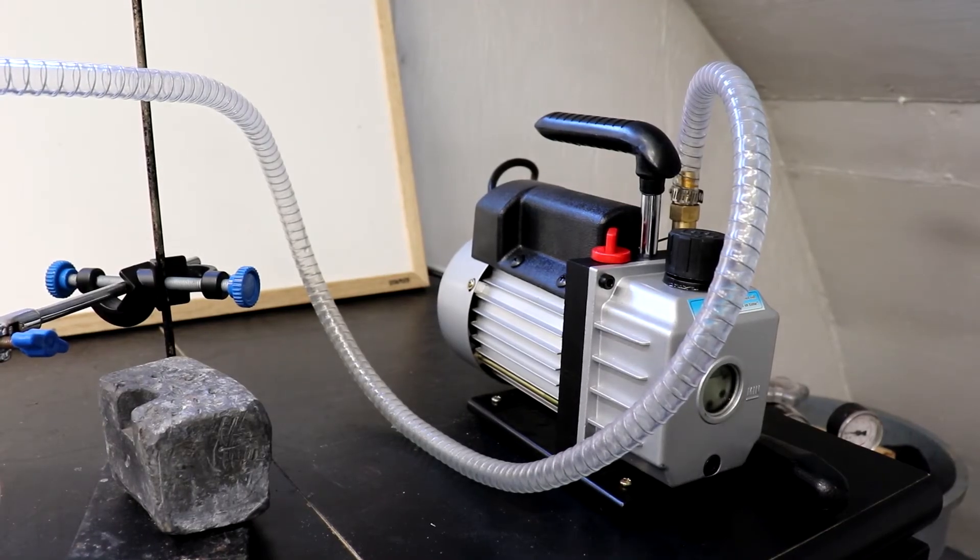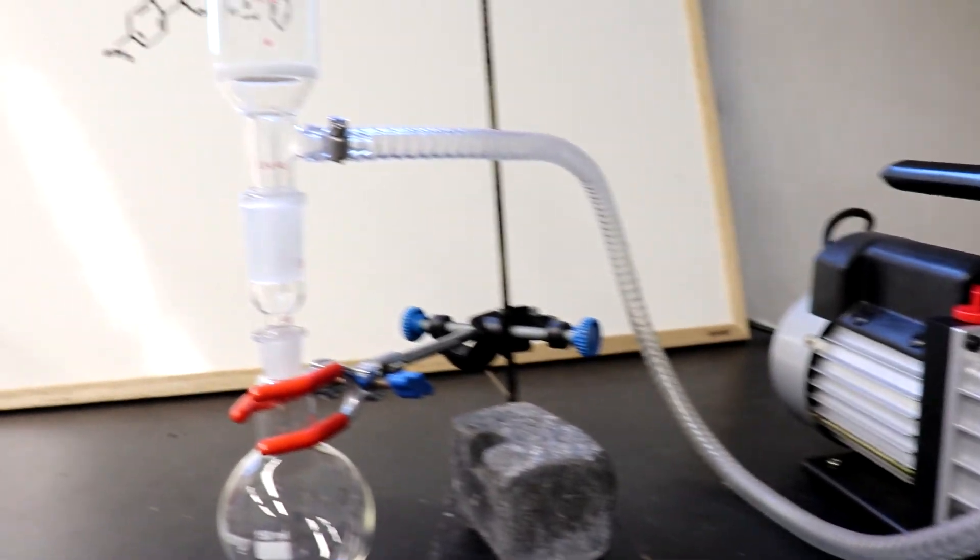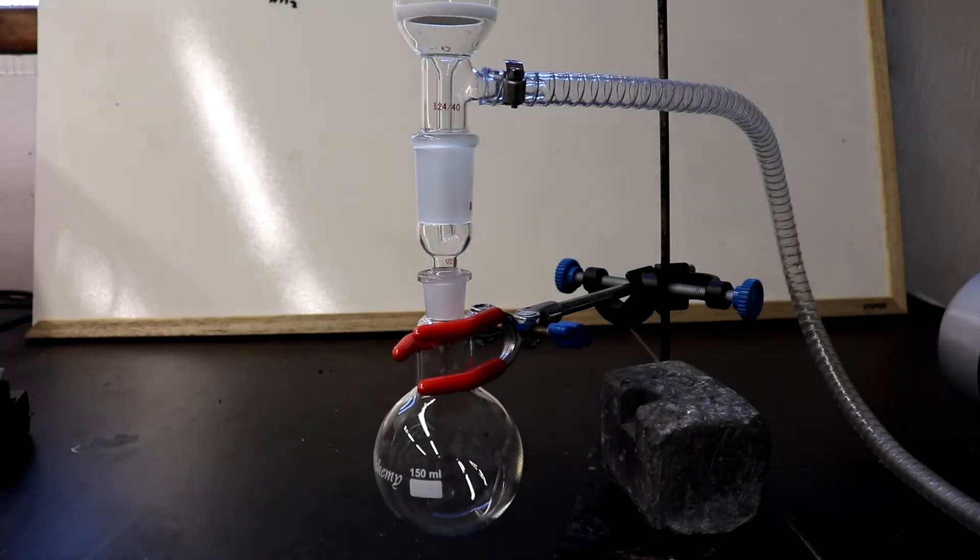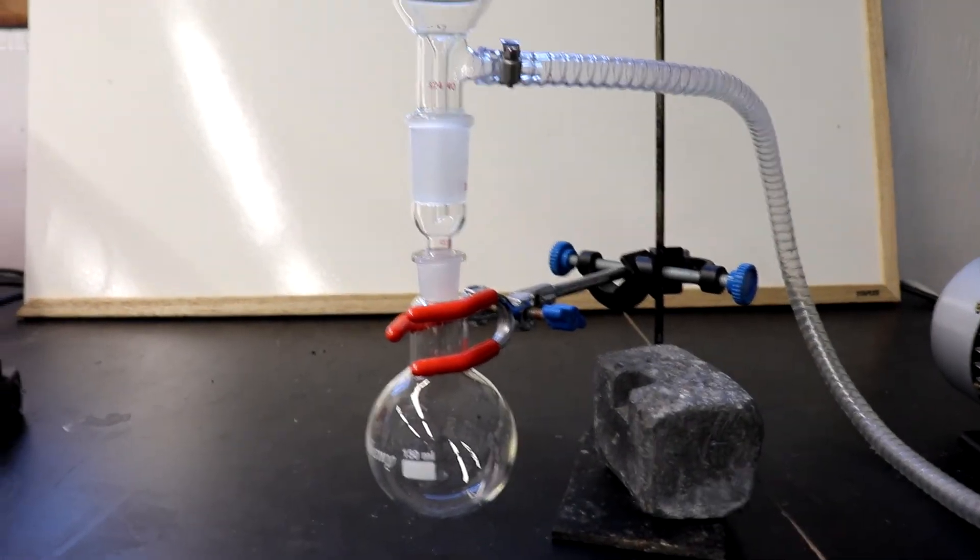So using this new vacuum pump I got, we're going to do a vacuum filtration with the Buchner funnel into our flask that we're going to then use to distill the aniline.